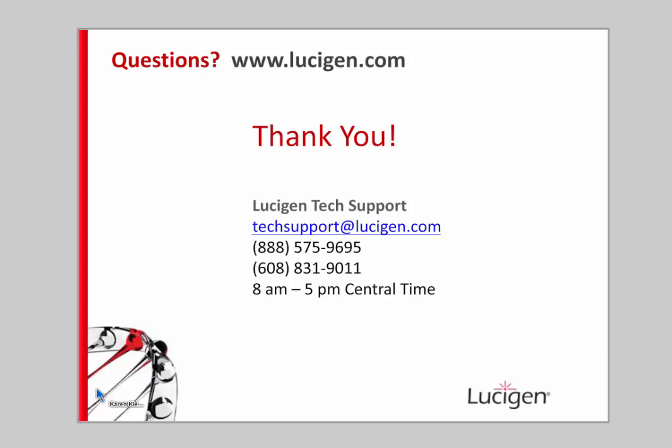Okay, great. Thanks, Beth. And we have a question also about inclusion bodies. Are there any methods to avoid it, apart from changing the E. coli strain? Well, that's a great question. Inclusion bodies are a tough one, right? Protein solubility is a very challenging thing to overcome. And there are some different methods.